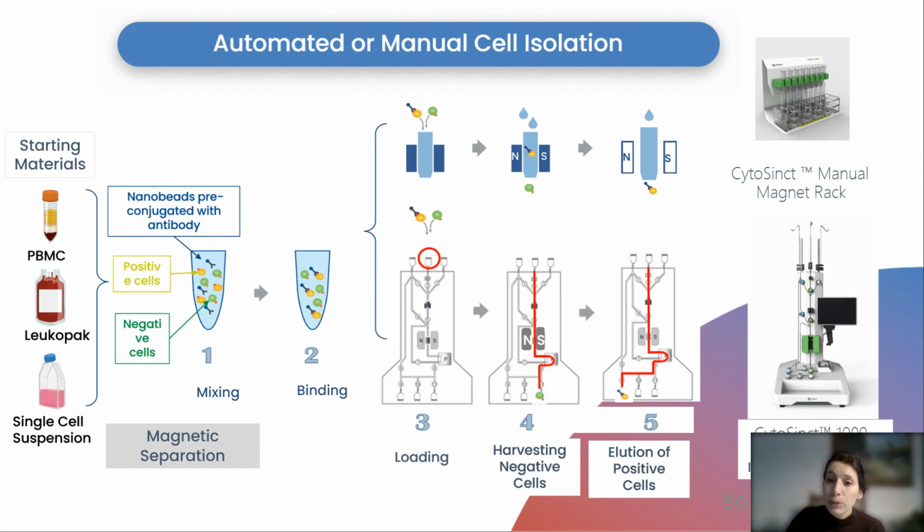So overall, very briefly, I did want to mention that basically we do have obviously both the manual workflow as well as the automated workflow for cell isolation.